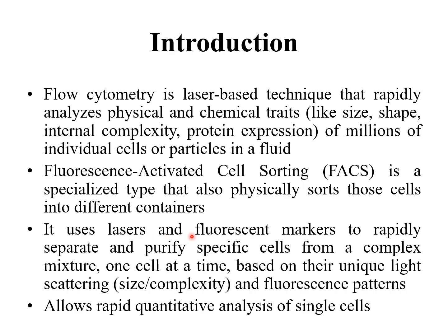It uses laser and fluorescent markers to separate and purify specific cells from a complex mixture, one cell at a time, based on the unique light scattering and fluorescence patterns. It allows rapid quantitative analysis of single cells.